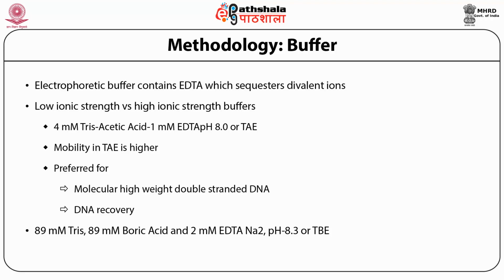In low ionic strength buffer, nucleic acids carry more current and migrate faster. Borate is inhibitor for many enzymatic reactions, and thus TBE buffer is to be used with careful decision, as borate can inhibit many of the enzymatic reactions. In that situation, the use of borate buffer is to be avoided. Both buffers inhibit protonation of DNA and protect DNA molecules from enzymatic degradation.